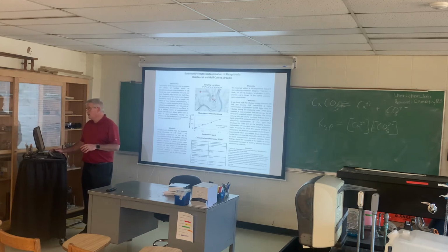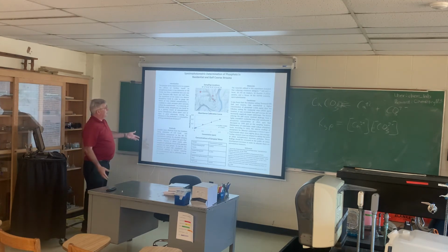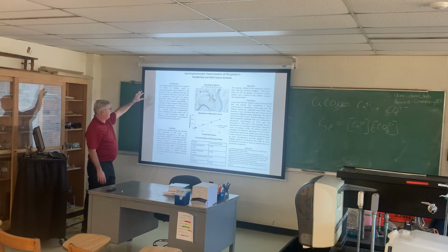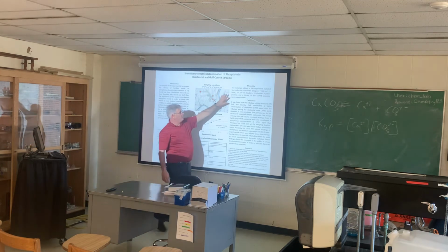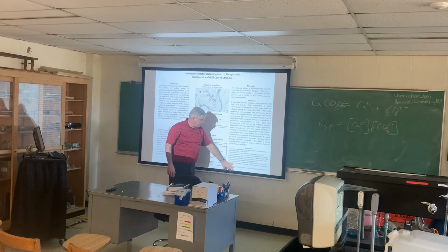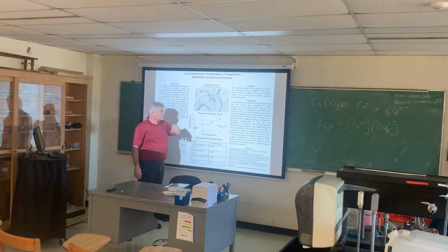All right. This is an example of the final culminating poster, on the spectrophotometric determination of phosphate in residential and golf course streams. It gives an introduction, the methods that were completed, the materials that were used, a conclusion to their data, and then the references that they got their information from for each part of this project.